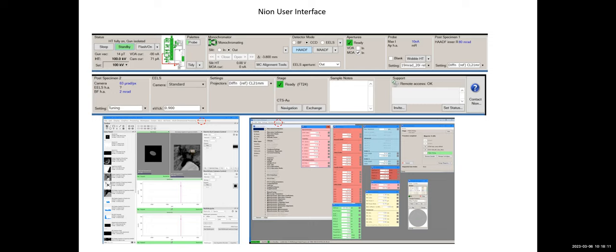Here, I have a question. It's a very simple question. Why do we need those apertures? What is their function? So you're trying to cut off the parts of the beam that don't have a uniform phase so that you minimize the aberrations once you've corrected. Okay, so yeah, that is correct.